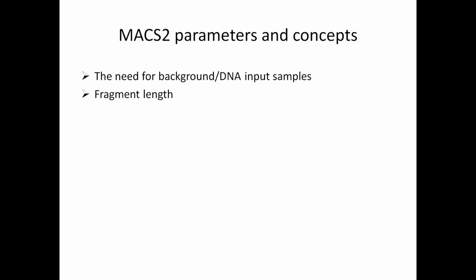In a single-end read mapping, only one end of the DNA fragment is actually sequenced. Therefore, it is not known how long each DNA fragment captured by the immunoprecipitation was. This information is required to accurately create the pile-up of fragments and calculate the position of the summit, or the highest part of the peak.